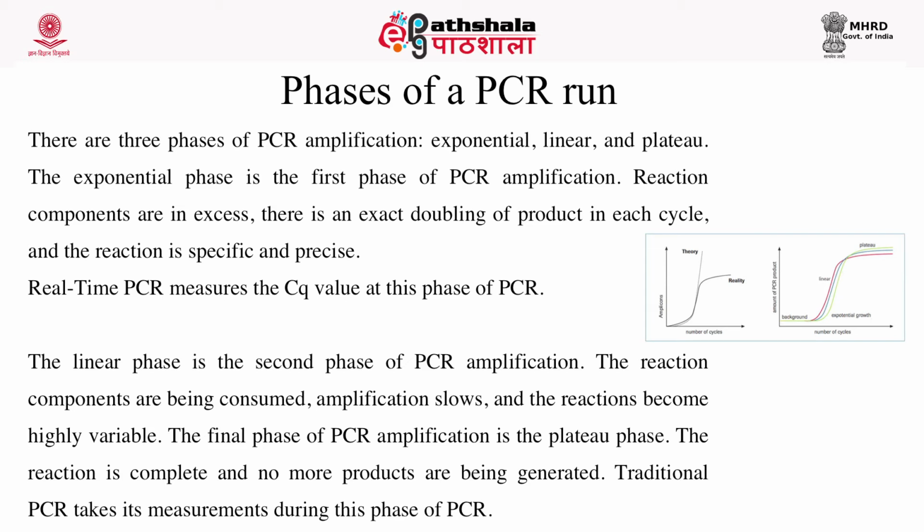The final phase of PCR amplification is the plateau phase. The reaction is complete and no more products can be generated. Also, the limiting factors here are the dNTPs, the enzyme as well as the other factors. Traditional PCR takes measurements during this phase of the PCR reaction. This is one of the limitations of PCR.